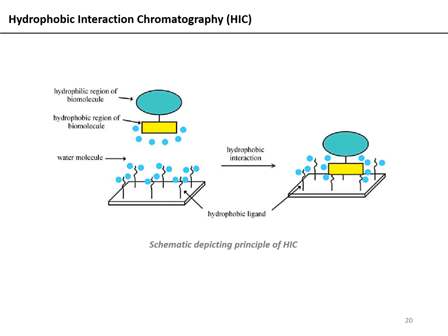For example, if your protein has low hydrophobicity, it will bind at very high salt concentration, and when you decrease the salt concentration only gradually, it will elute out. While proteins which have higher hydrophobicity, in order to elute them, you have to decrease the salt concentration even further to promote their solvation.